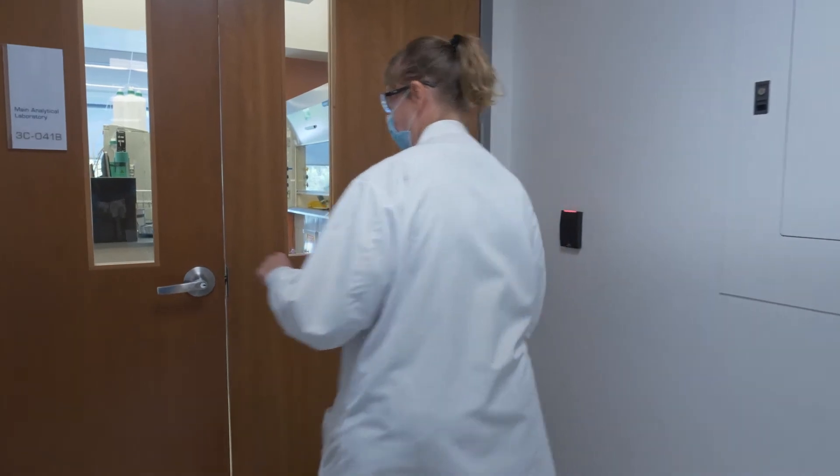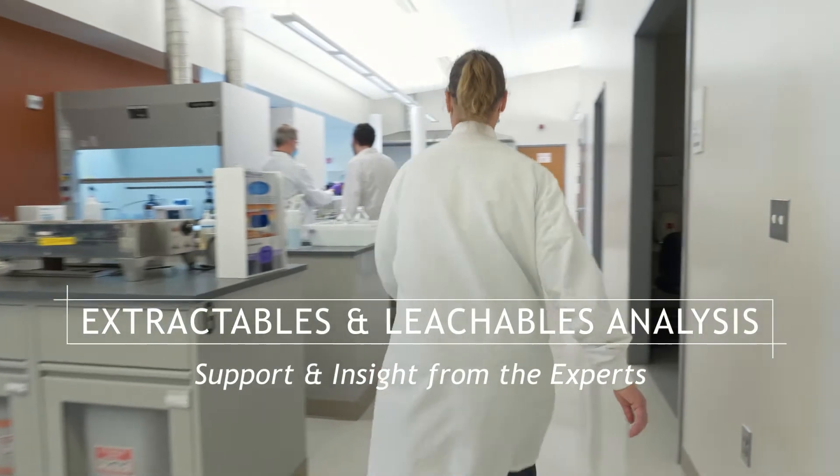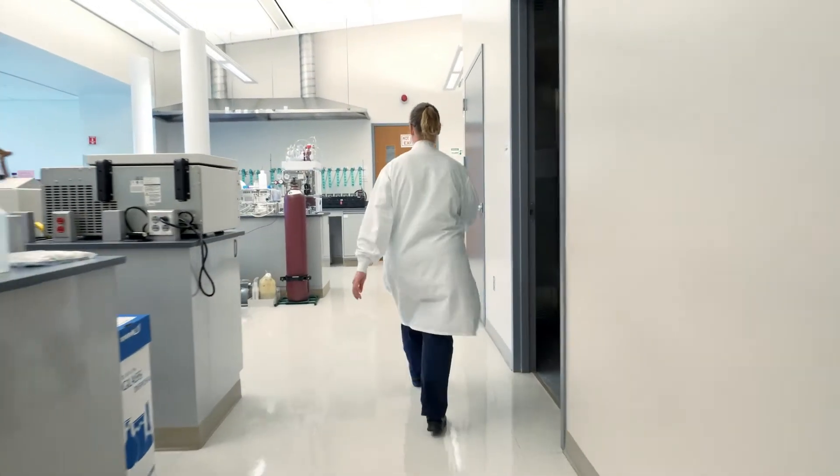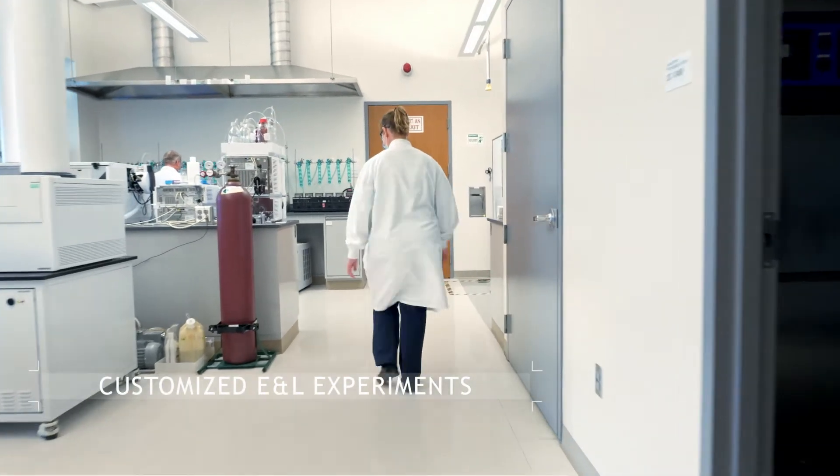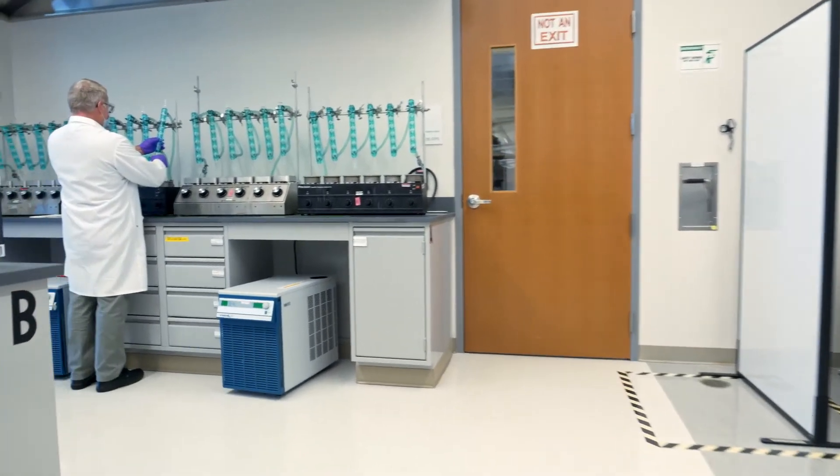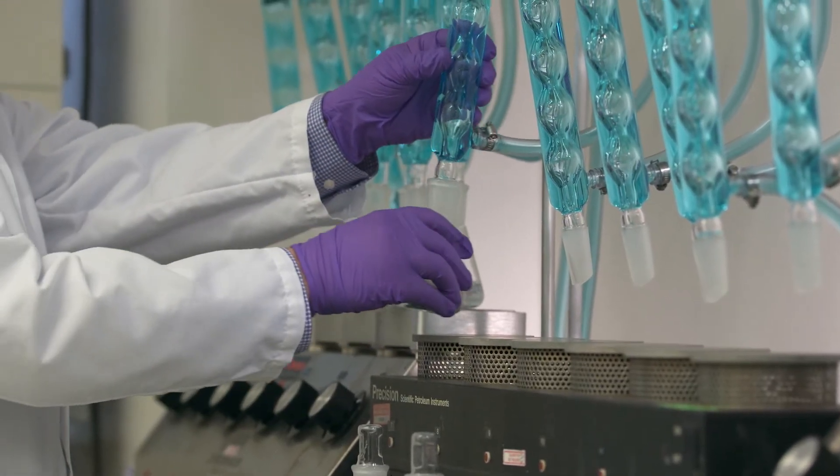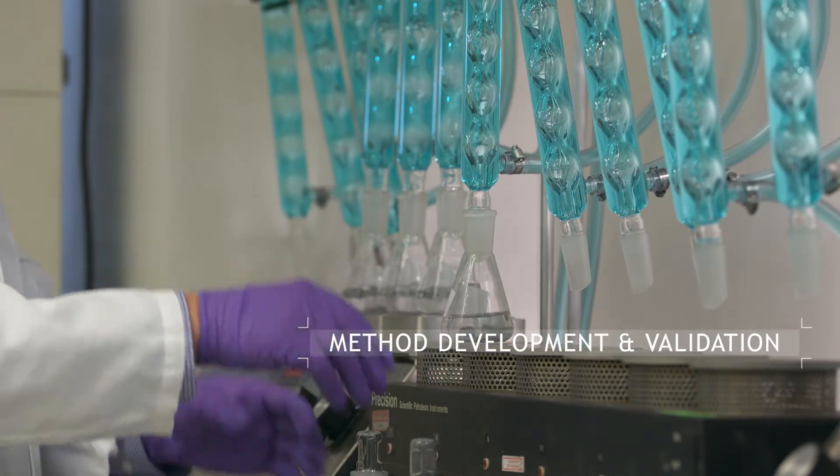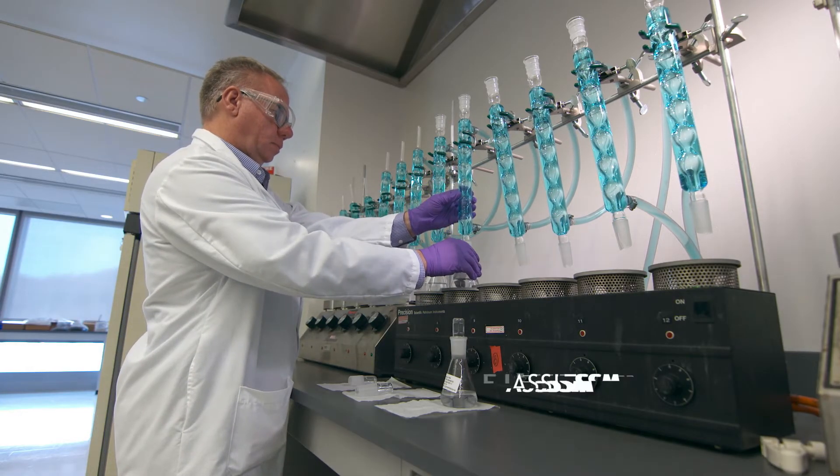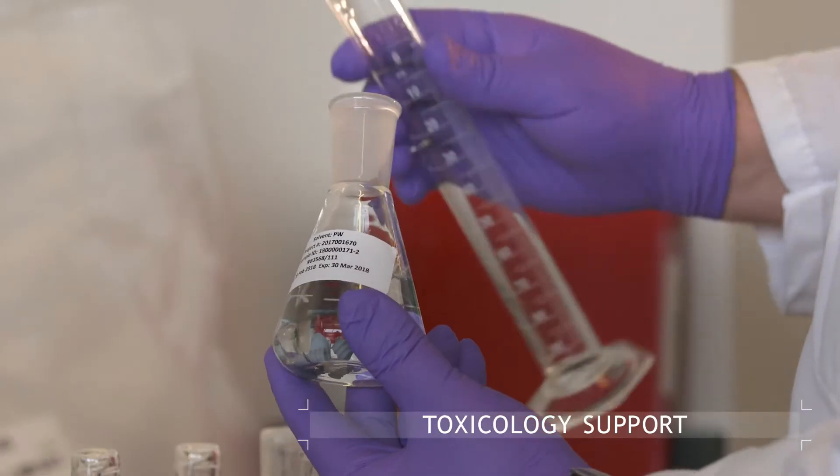WEST has a dedicated extractable and leachable group that includes industry-recognized experts who can provide customers with meaningful E&L information. We perform customized studies that follow the most current regulatory requirements and guidance and partner with our clients on extractable, simulation and migration studies, leachables method development and validation, leachables stability testing and storage, and risk assessments using our E2L assessment and toxicology support.